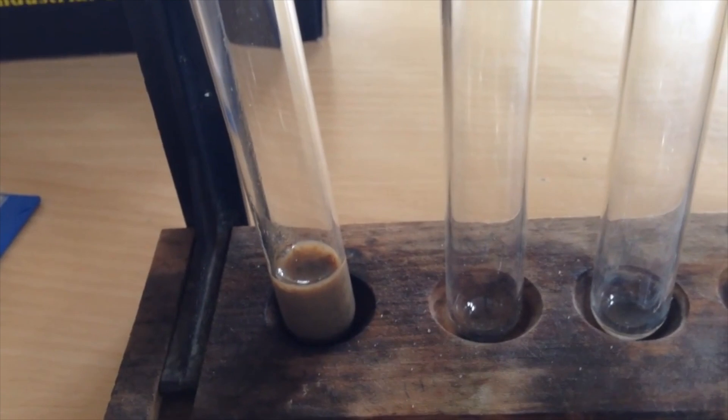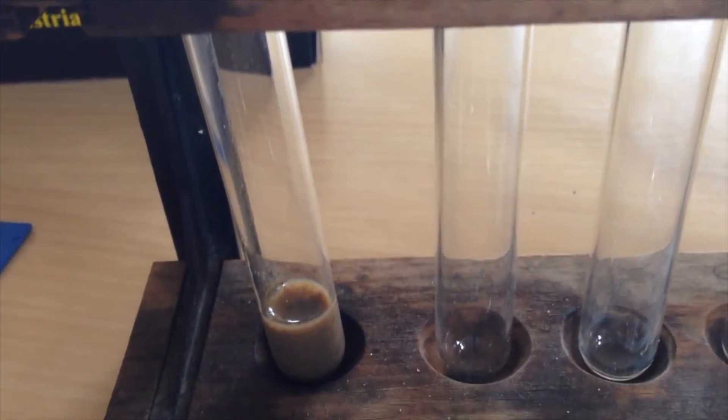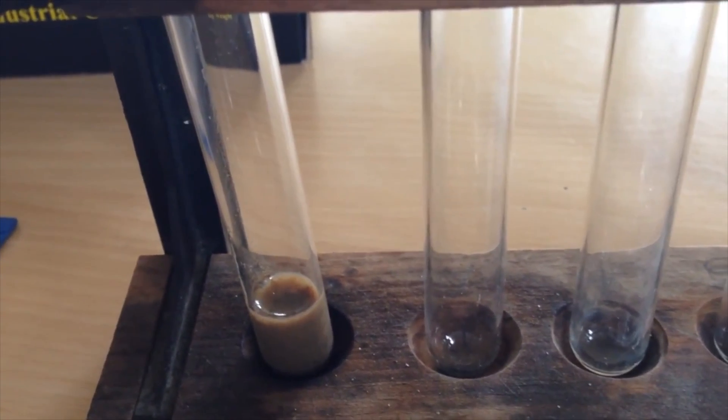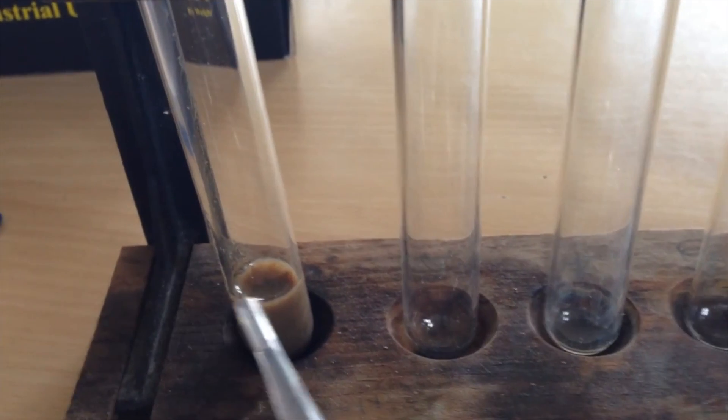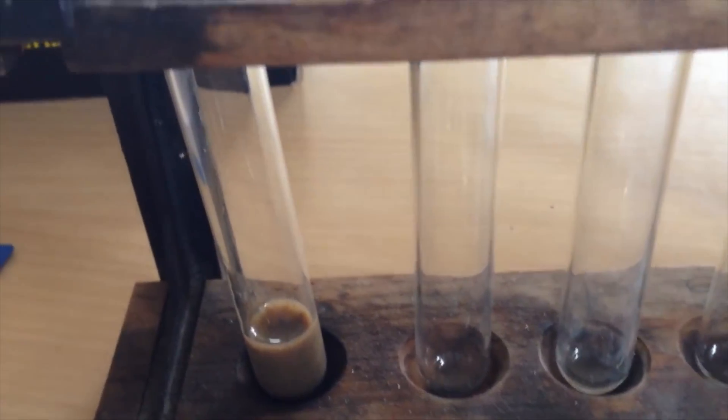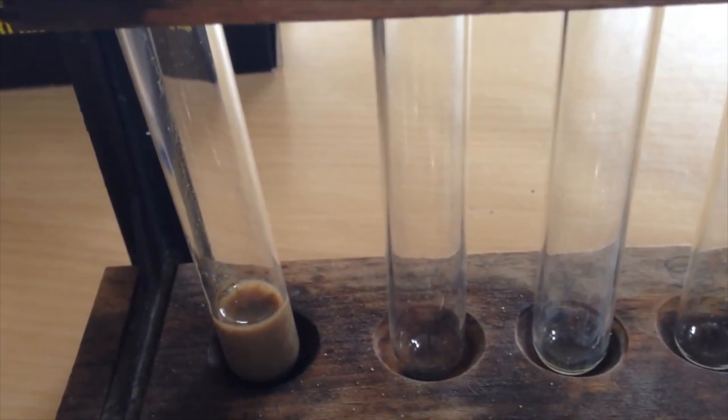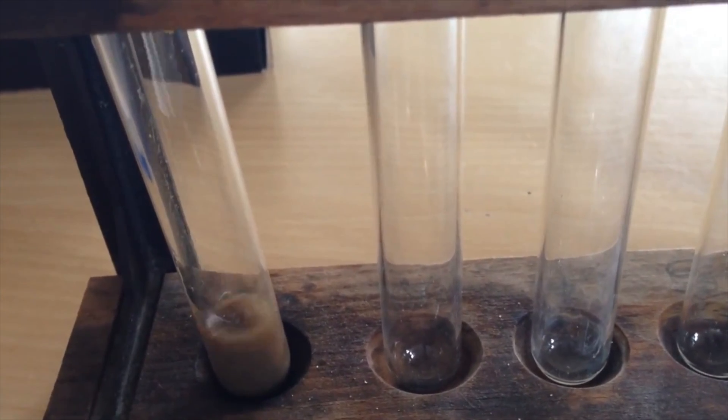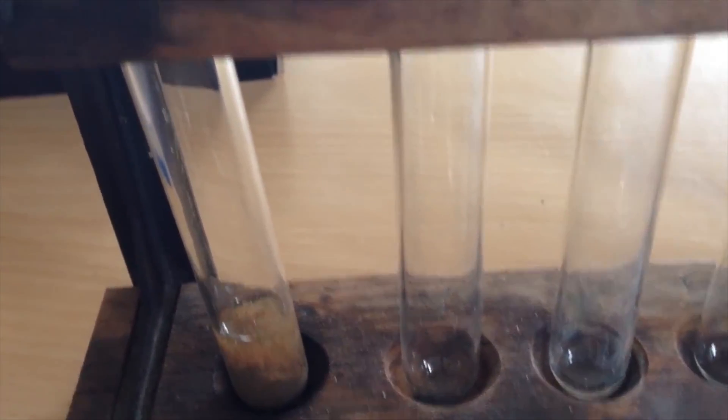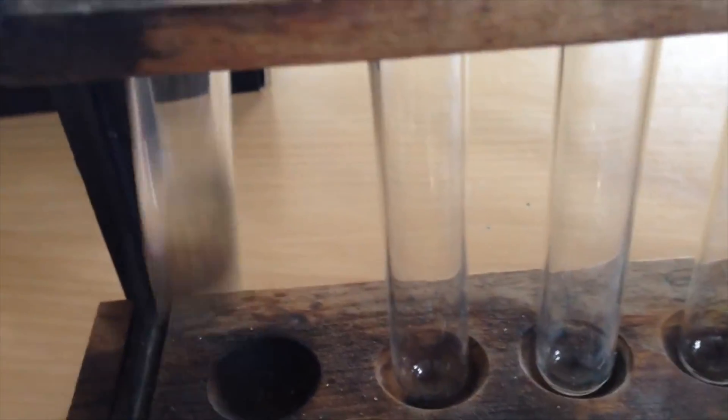Here we are going to be testing for the presence of ethanal. This is a Tollen silver mirror test. In the beaker here I have sodium hydroxide, silver nitrate. I'm just going to add dilute ammonia just enough to completely dissolve the precipitate.